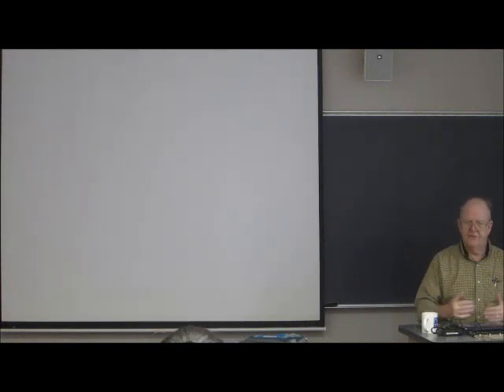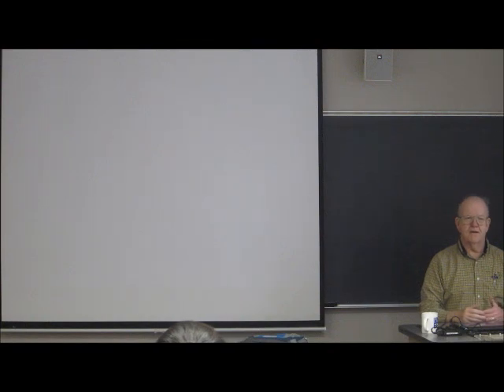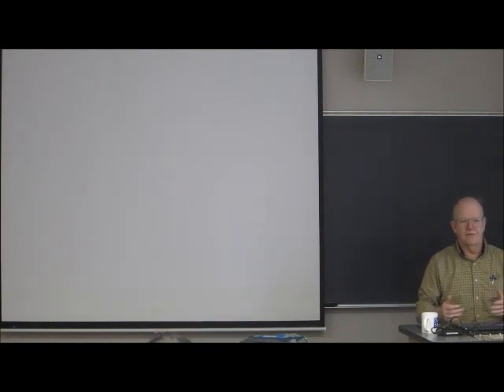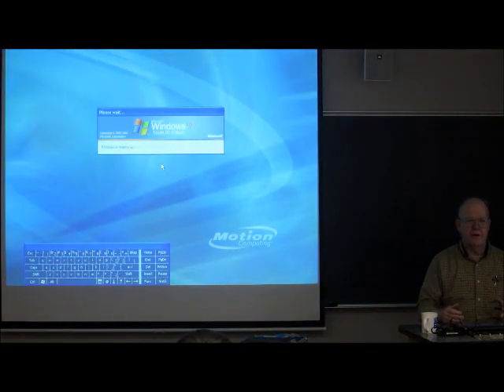The other day I had just started to introduce the Giddings-Davis statistical overlap theory, which is a big advance on the concept of peak capacity. At least that's one way you can look at it. The peak capacity is the maximum possible number of peaks that you can fit in your separation window, separation time or separation volume, or whatever units you want to use.